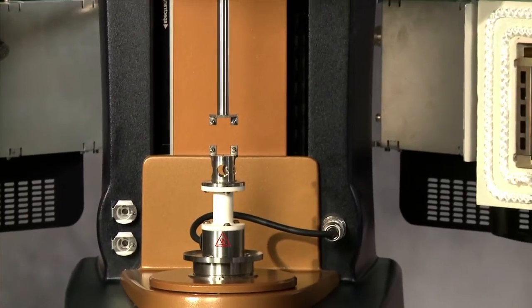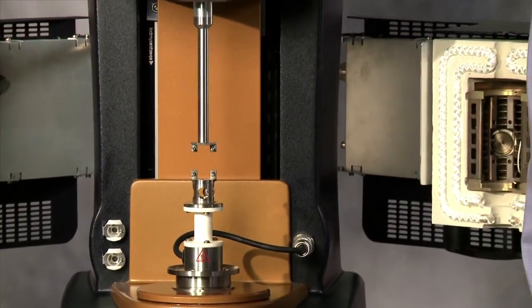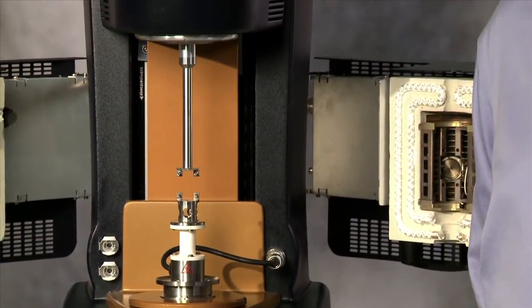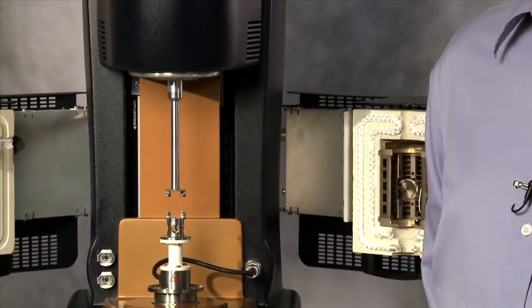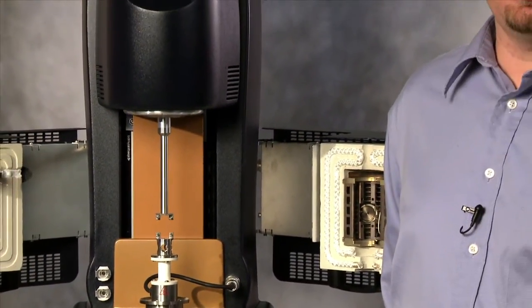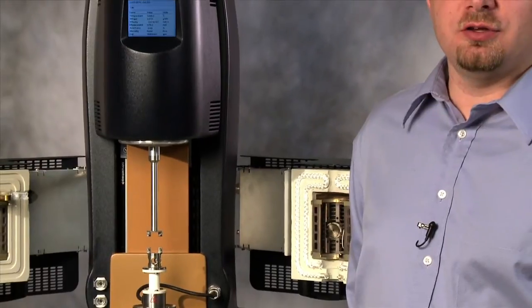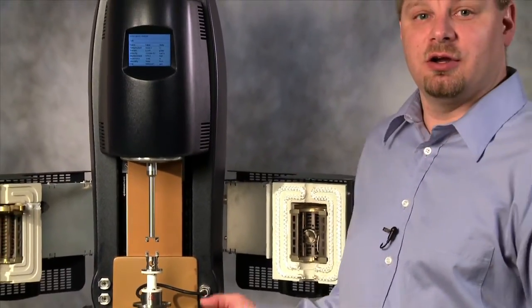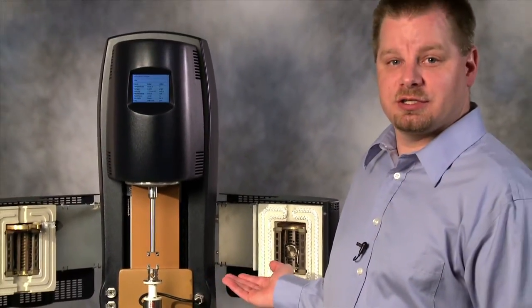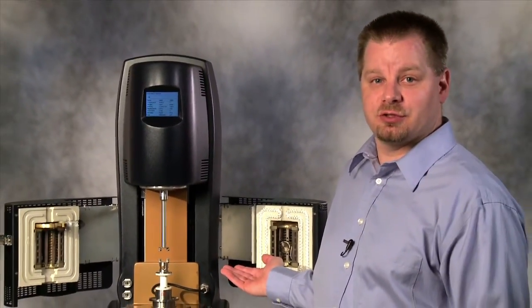The rectangular torsion geometry is used to analyze solid materials. When mounted to the DHR, you can use the ETC, the Environmental Test Chamber, for temperature control.